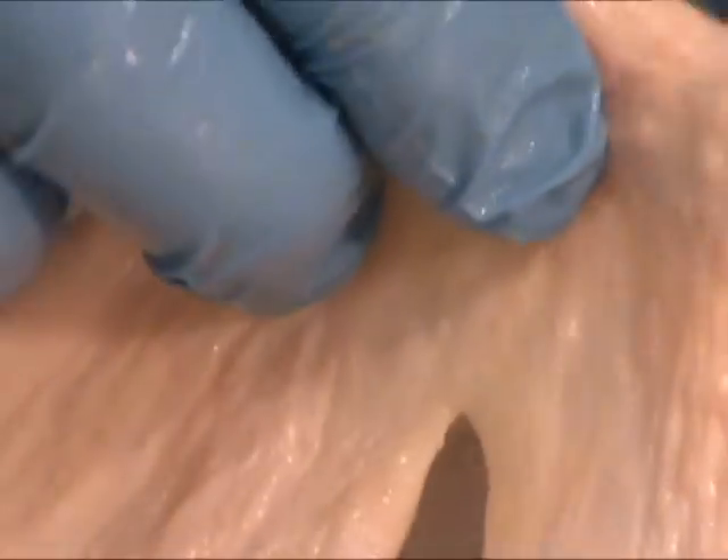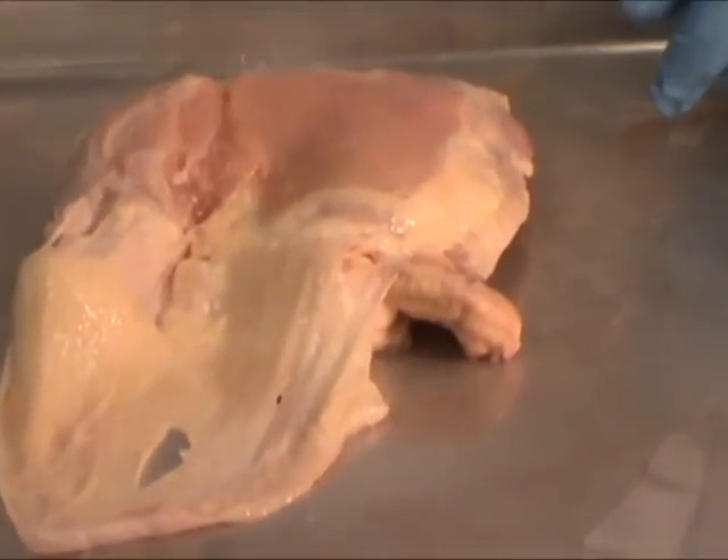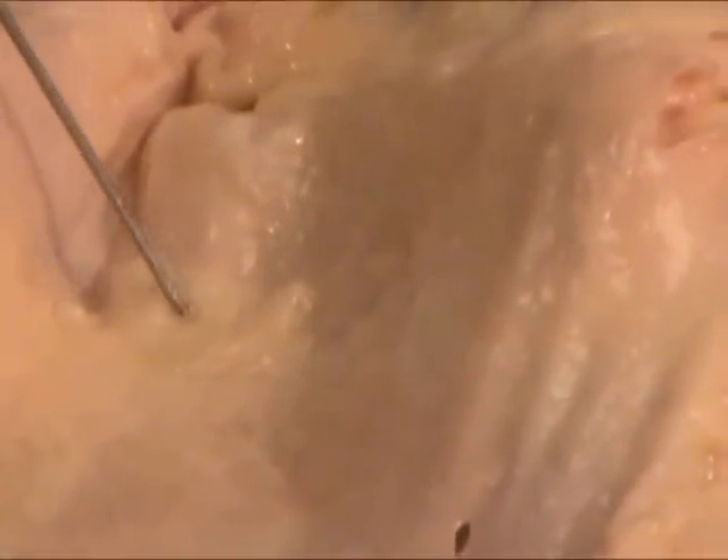If I reflect the skin back to reveal the muscle tissue beneath, on the underside of the skin, you'll notice a very yellow, oily-type substance, which is the fat, or the hypodermis layer, of the skin.